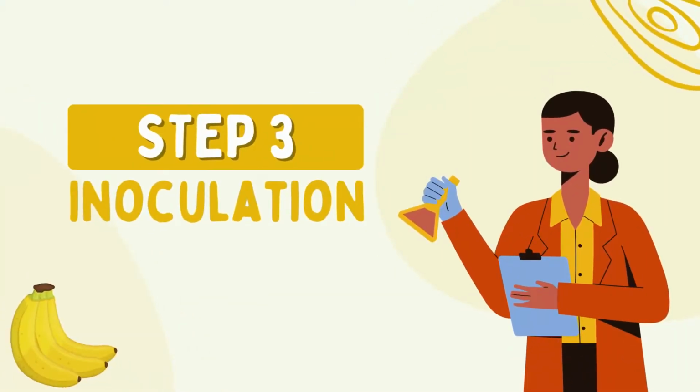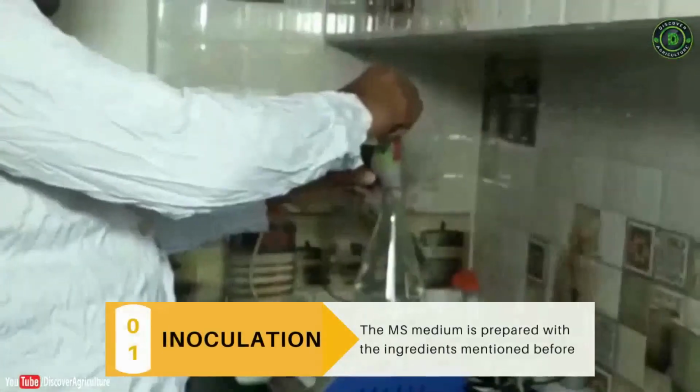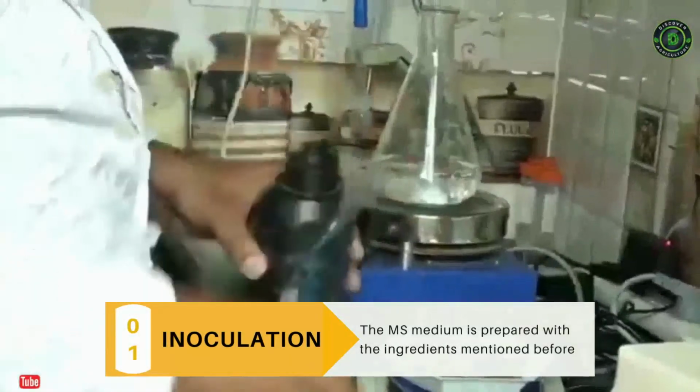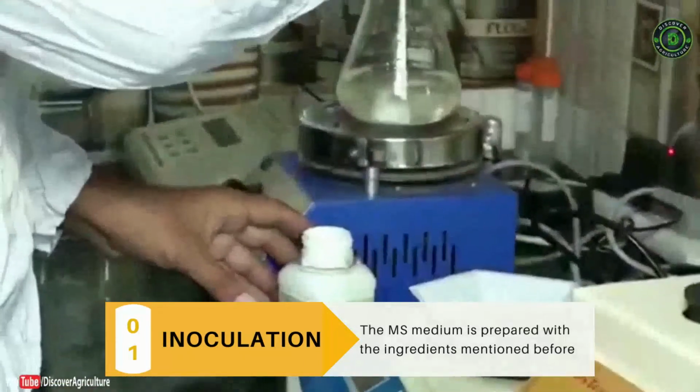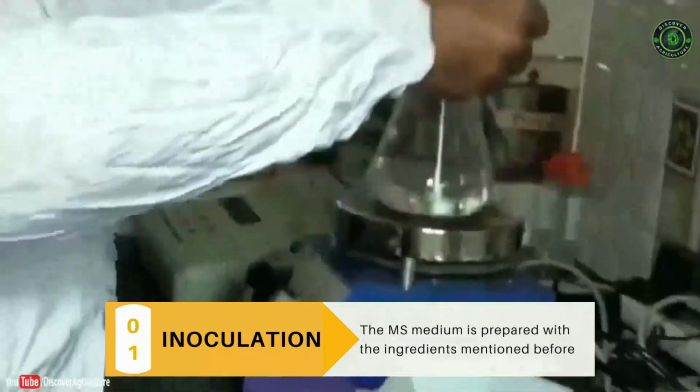The third step is inoculation. Murashige and Skoog medium is used in this technique. The ingredients for tissue culture media for banana shoot growth include MS macronutrients, MS micronutrients, MS vitamins, Fe-EDTA, BAP plant hormone for growth, sugar, coconut water, and agar. During the inoculation step, the MS medium is prepared with the ingredients previously mentioned. Scalpels, forceps, cutting plates, and Magenta boxes are autoclaved according to standard autoclaving procedure.